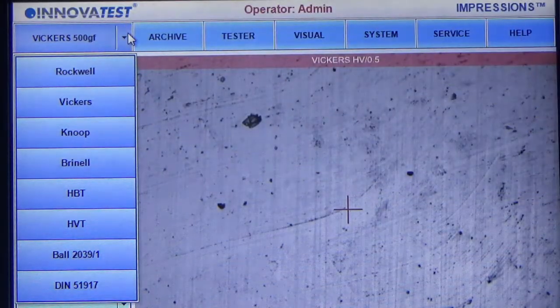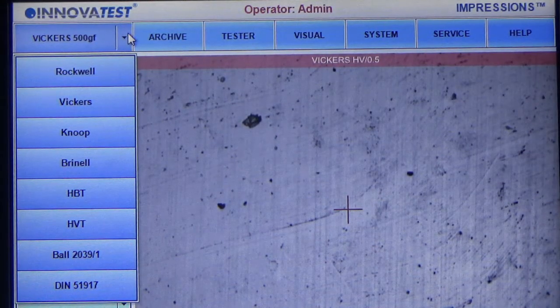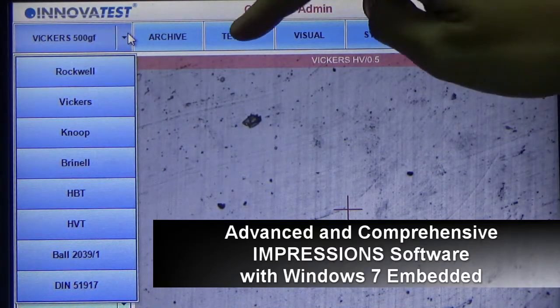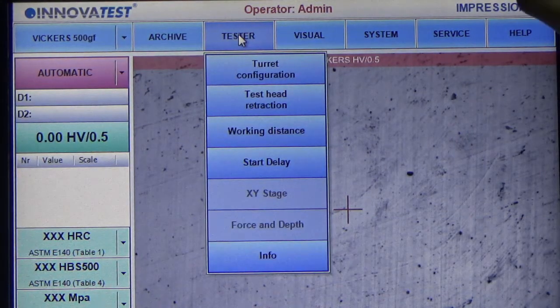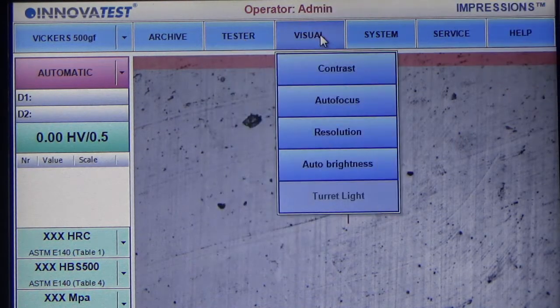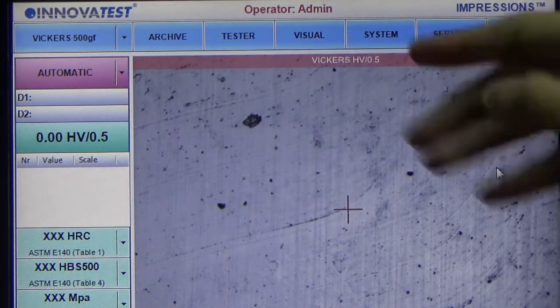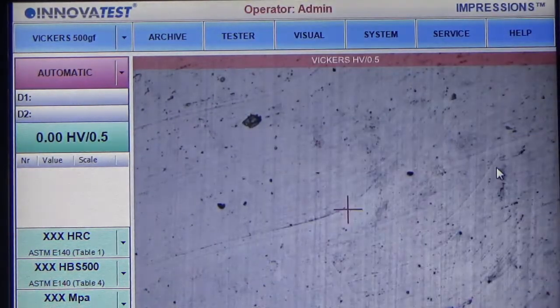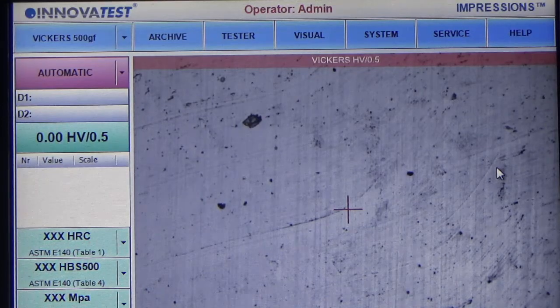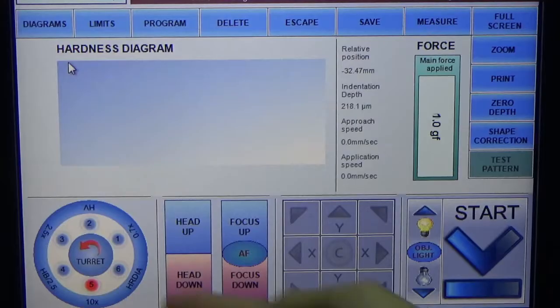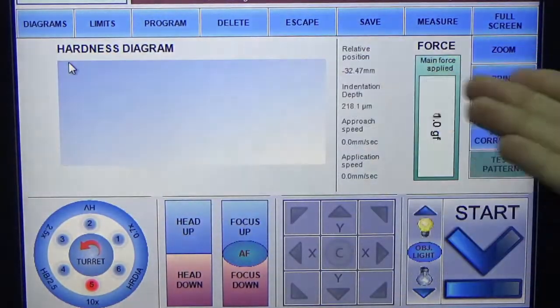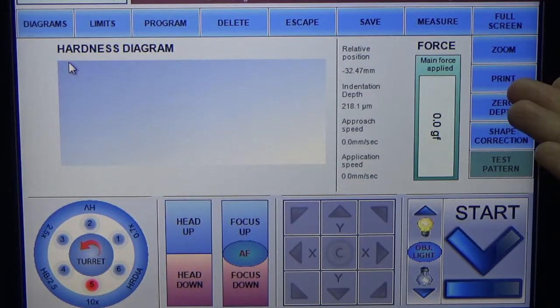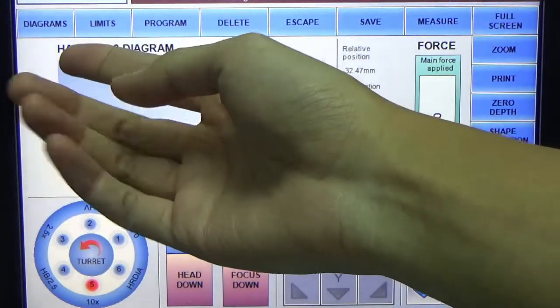The rest of the software remains the same. Here you have archive, tester configuration, as well as this feature. This part here is actually a live image showing the surface of the sample. At the bottom part, which is standard from Impression software, you have these diagrams.